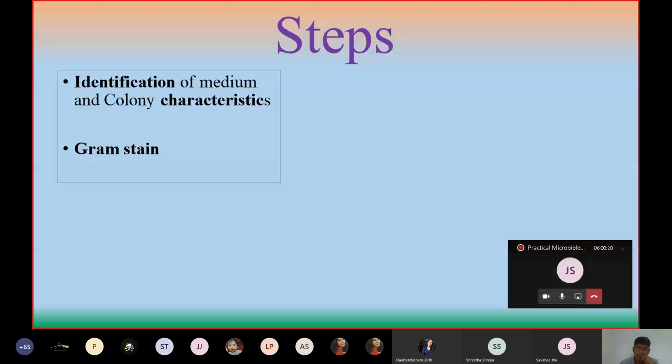Along with gram stain, I told you we may do ZN staining also. We may do other special staining also. Gram staining we do for almost all organisms. If we are suspecting the organism could be mycobacteria, or if we are seeing an organism that is producing spores, at that time we may do ZN staining or modified ZN staining based on need. So suspicion is there, and based on it we do gram stain, ZN stain, or certain special staining. If we suspect Corynebacterium diphtheriae, then we go for Albert stain. So after this staining, now after staining is over, what do we do?